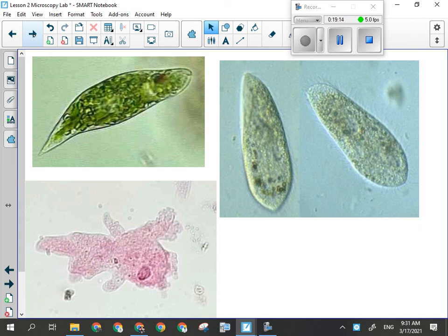If I'm looking at Jazz right now, everybody behind her is out of focus. But if I focus on Marcus, Jazz is out of focus, right? Same thing happens with the microscope. The amoeba is thick enough that I'll only get parts of it focused at one time, and then it's hard to get a good picture of it.